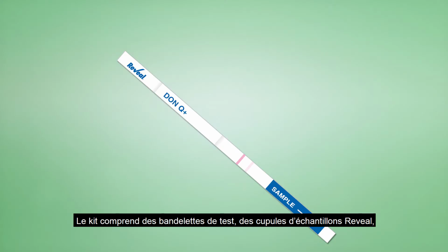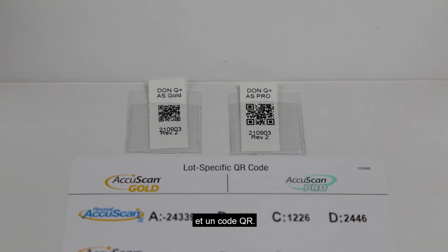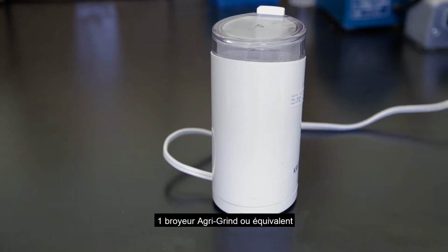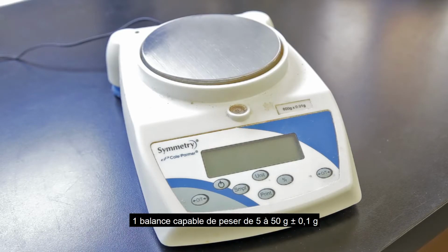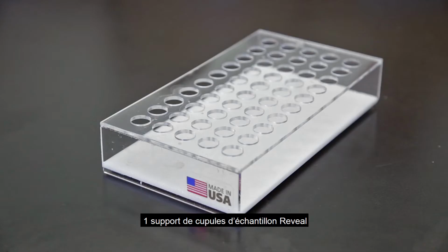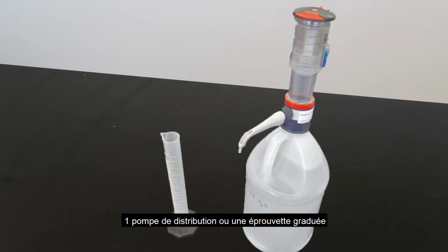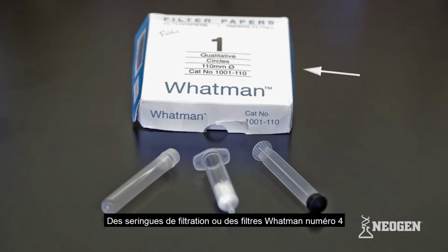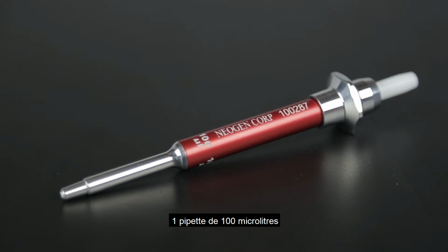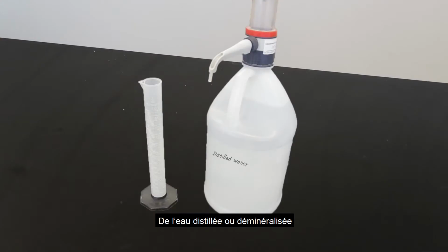The kit includes test strips, Reveal sample cups, sample dilution cups, sample diluent, and the QR code. To conduct the test, you also need the following: sample collection cups with lids, an Agra-Grind or Bunn grinder, a scale capable of weighing 5 to 50 grams, accurate to plus or minus 1/10 gram, a timer, a Reveal sample cup rack, the Reveal AccuScan GOLD reader, dispensing pump or graduated cylinder, filter syringes or Whatman No. 1 filter papers, sample dilution tubes with caps, a 100 microliter pipetter, a 500 or 1000 microliter pipetter and tips, and distilled or deionized water.